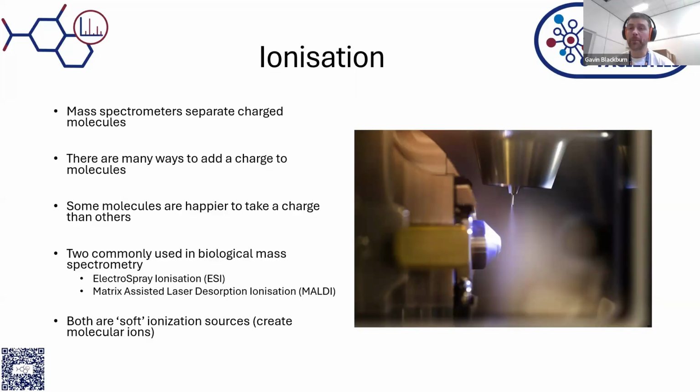If you put single compounds into the mass spectrometer, those hard ionization techniques can actually be really useful because you essentially get a fingerprint out as a mass spectrum, because the way these compounds break up is very specific to how they're put together. So if you have a compound and you break it up, you can start to do a jigsaw and try and fit those pieces back together and see if you can come up with not just the formula for that compound, but also the structure. But that requires you to put single compounds into your mass spectrometer.